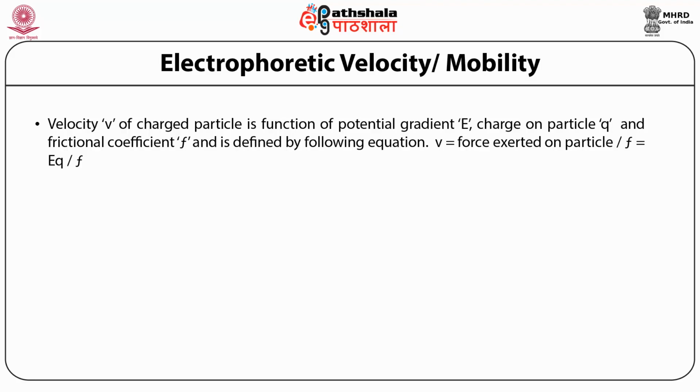Frictional coefficient will be dependent on viscosity of buffer, pore size of the support, and size of macromolecules such as protein. Temperature affects viscosity and therefore it will affect frictional coefficient and ultimately velocity.